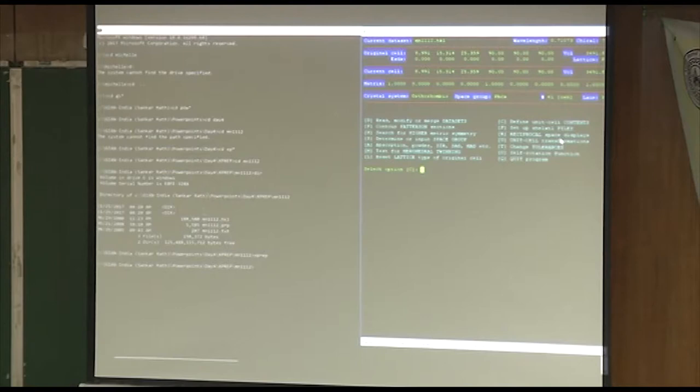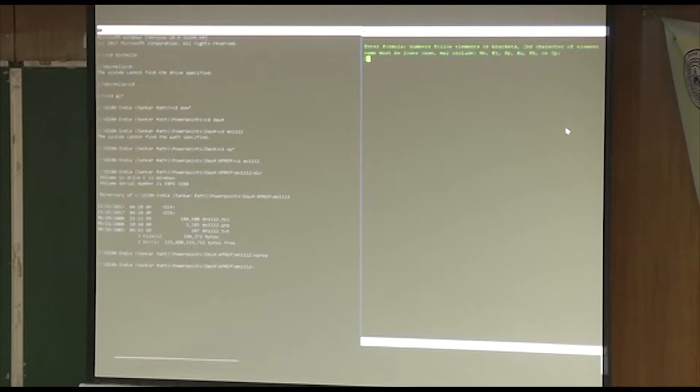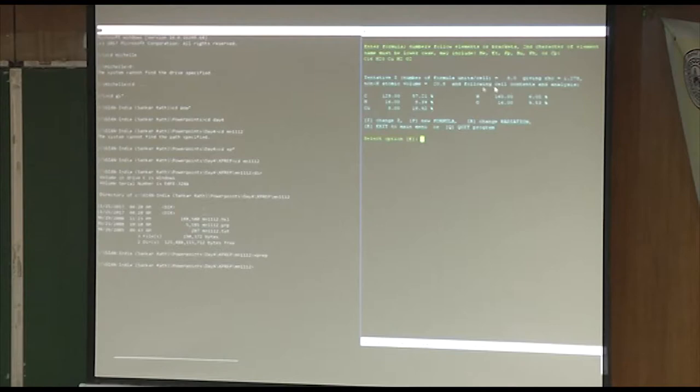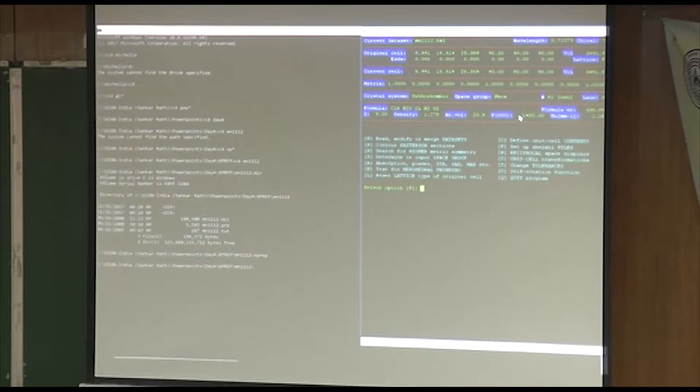Then E, exit to main menu. Now we need to put in the expected unit cell contents. The volume's 3492. PBCA has eight general positions. That's about 400 cubic angstroms per asymmetric unit, which would be about 20 atoms. Since I don't really know the structure, I'm just going to guess. I'm just going to say C16, H20, copper 1, N2, O2. And you see tentative Z is eight. That's correct for PBCA.